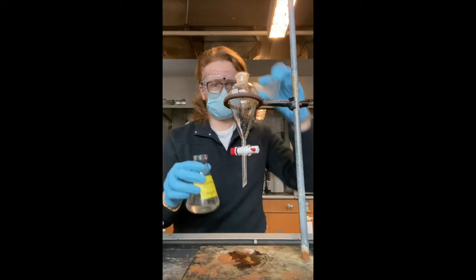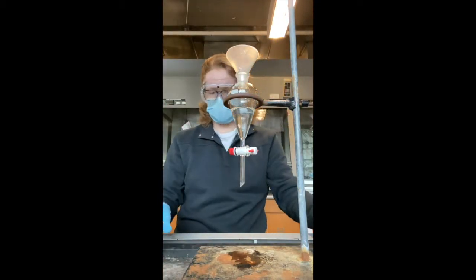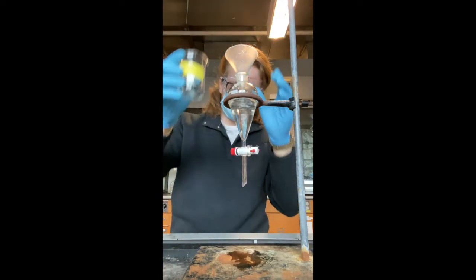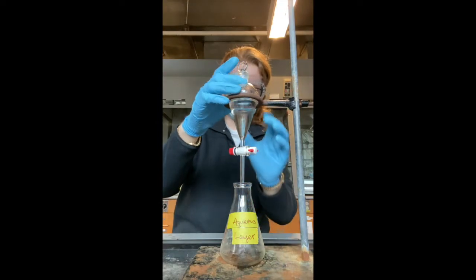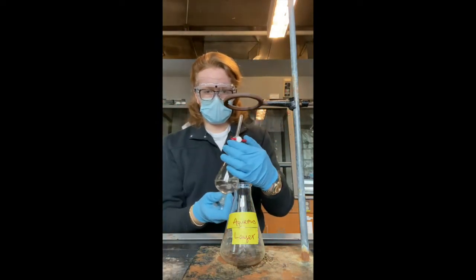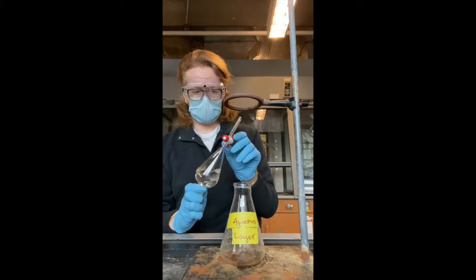Now, just as before, after ensuring that the stopcock is closed, you will want to place the funnel into the top opening of the separatory funnel and pour the aqueous layer back into the separatory funnel to continue with the extraction process. Then, you will pour in some of the solvent hexane to extract what is left of the compound in the aqueous layer one last time. After putting the glass stopper back into the separatory funnel, you are now at the final extraction point in this liquid-liquid extraction process, and you will once more repeat the procedure you completed to mix the organic and aqueous layer.